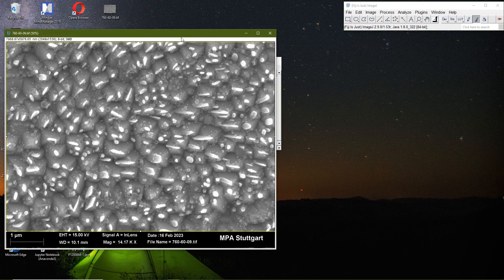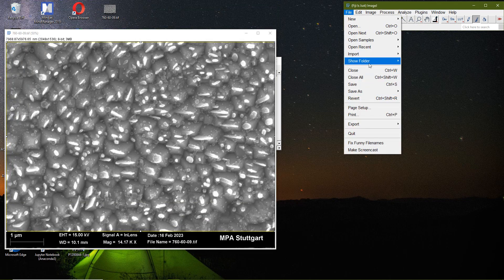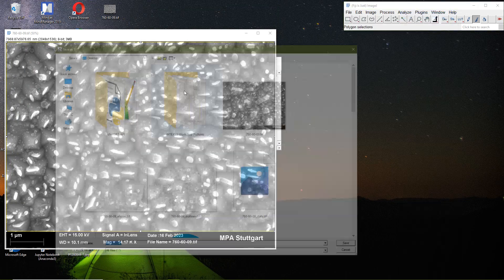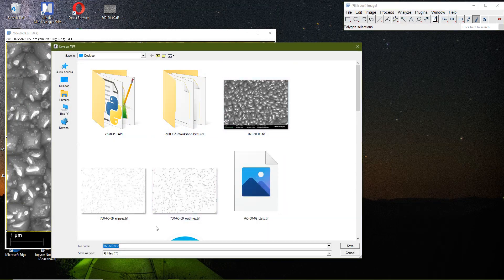The software automatically renames files based on the original file name, so this was our original file.